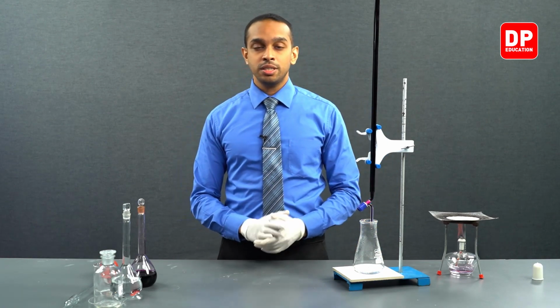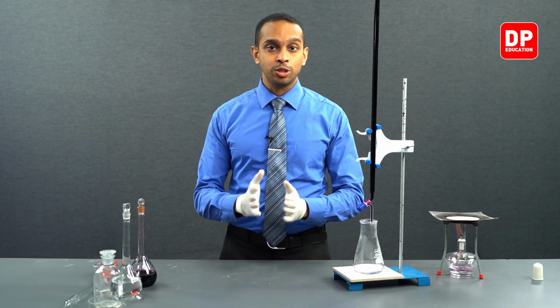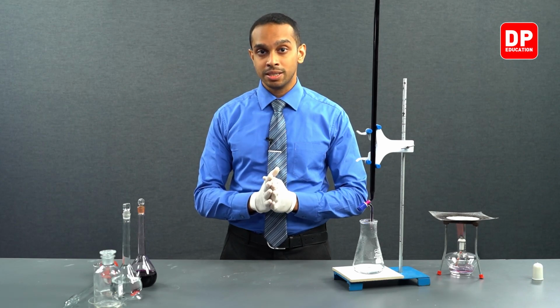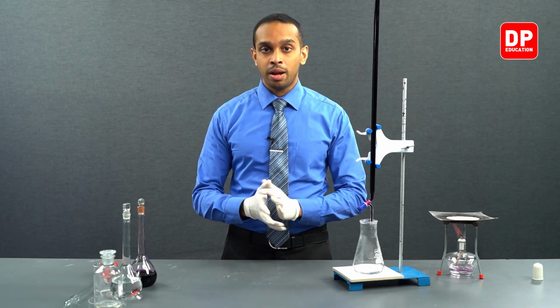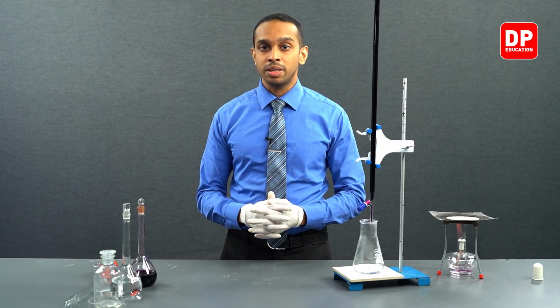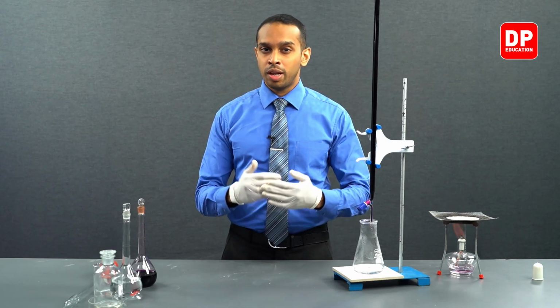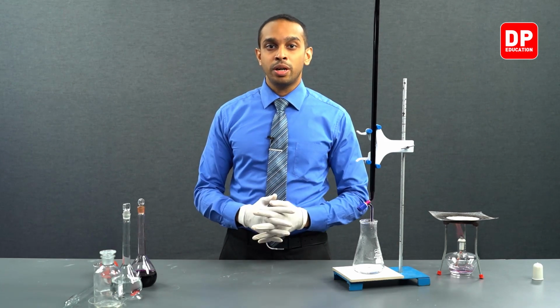In this titration, just like the second titration, since we know end point is going to be somewhere near 31.6, we can start adding potassium permanganate rather rapidly to about 25 cubic centimeters, and then from that point onwards we will slow down and we will add potassium permanganate little by little to obtain our endpoint more clearly.